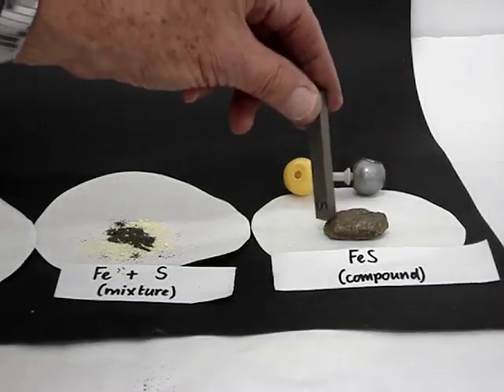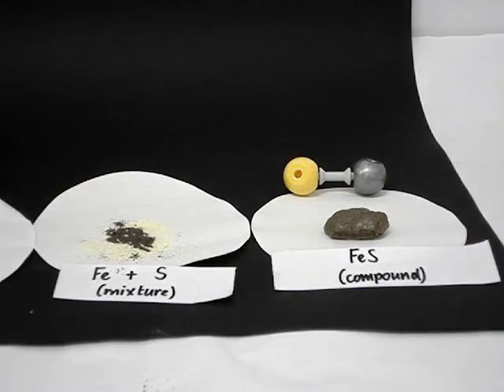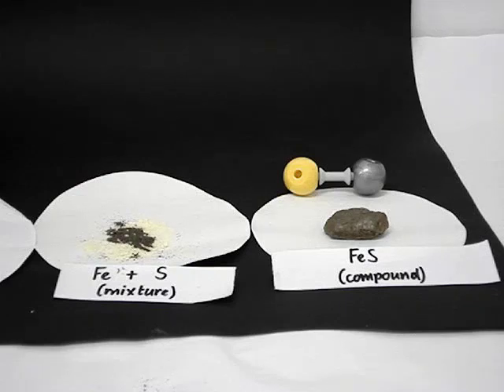Oh dear, no, it doesn't work. From that we deduce that in the compound iron sulfide, the iron and sulfur are actually chemically bonded, whereas in the iron and sulfur mixture, they are not.